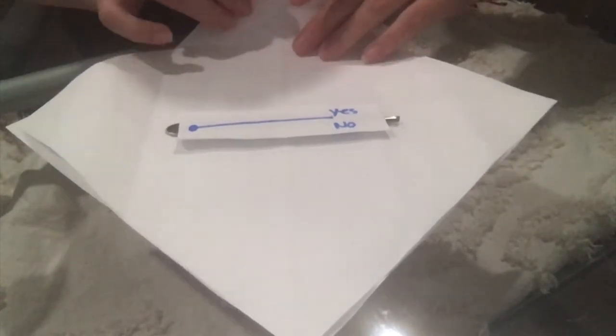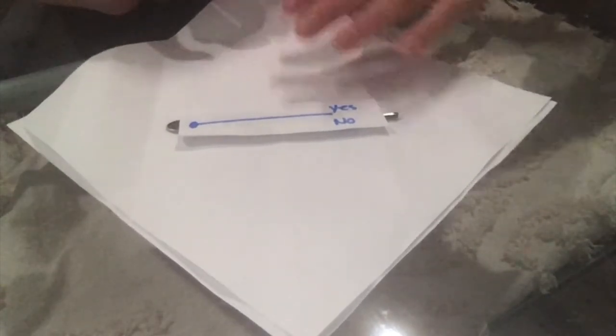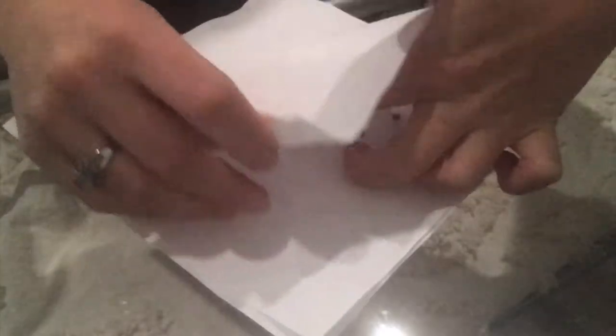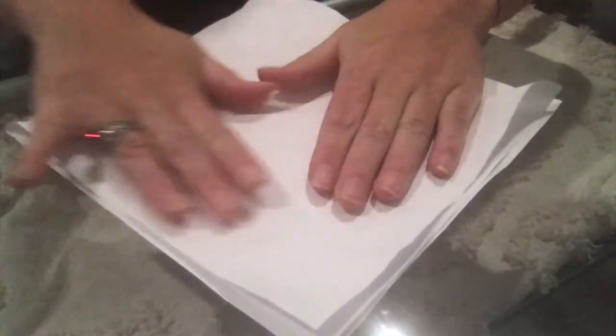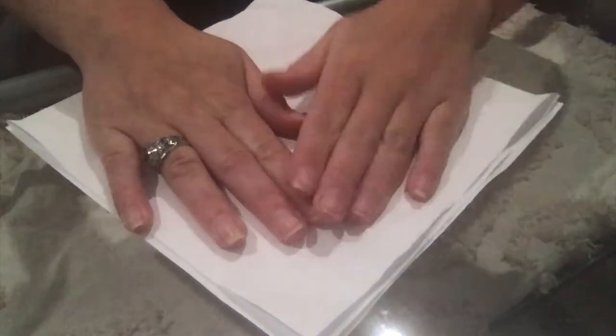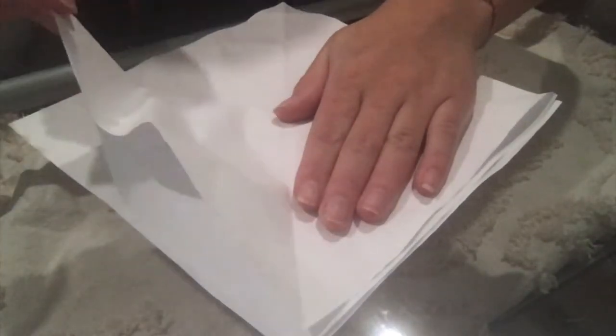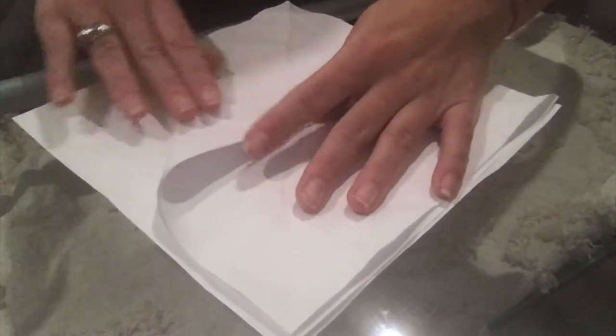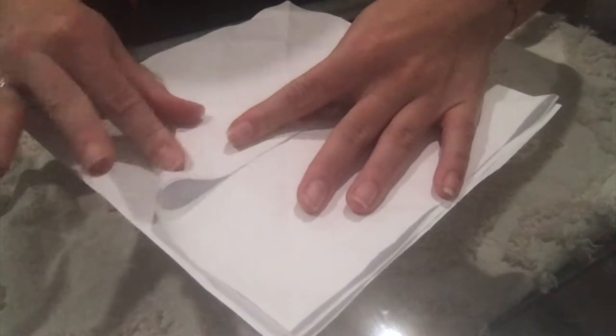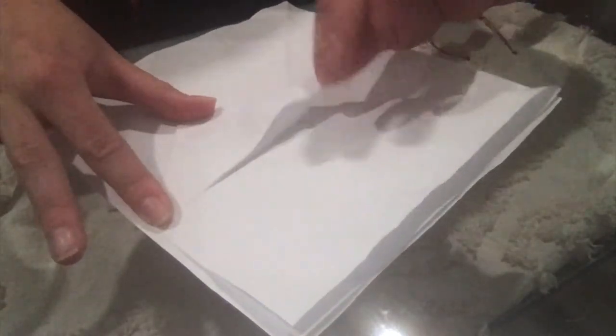Grab the first paper's bottom half and fold it up to the top. Since it's square, it should be a perfect fold. Then grab one side of the first paper and tighten around the object inside, making sure the corners are touching, and do a little fold — like a triangle.